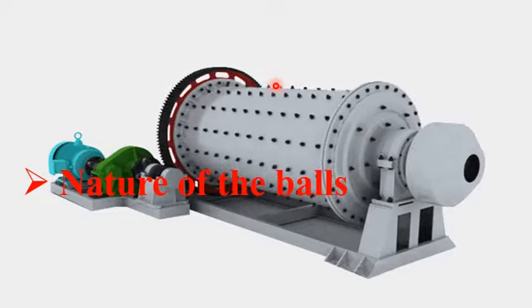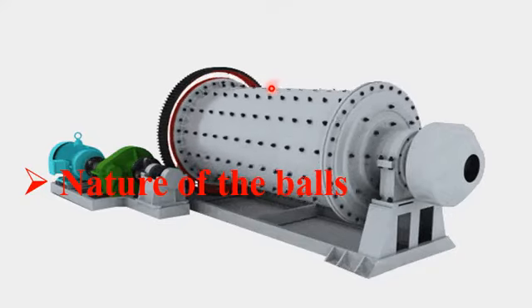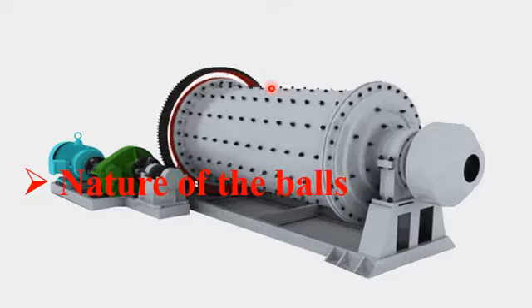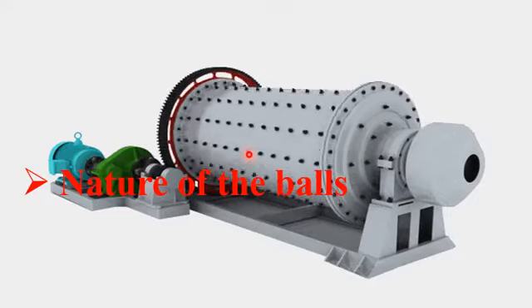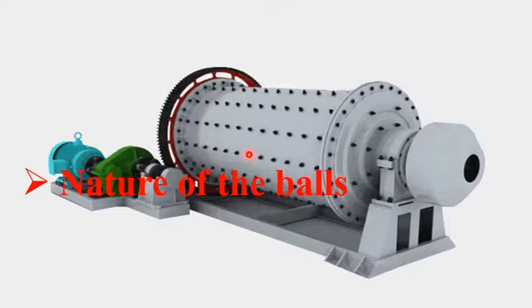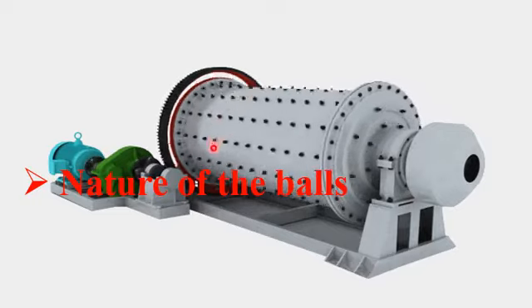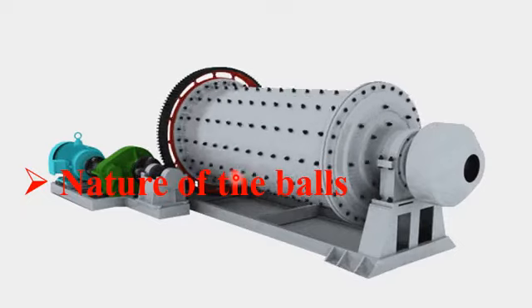So the most commonly used materials as a ball in ball milling operations, as I have discussed, are steel, tungsten carbide, zirconia, alumina, and also silicon nitride. So these are the key types of material used as a ball to prepare or to crush the bulk material.